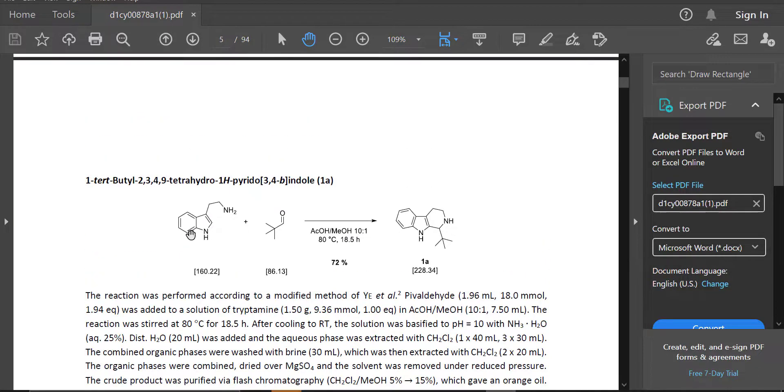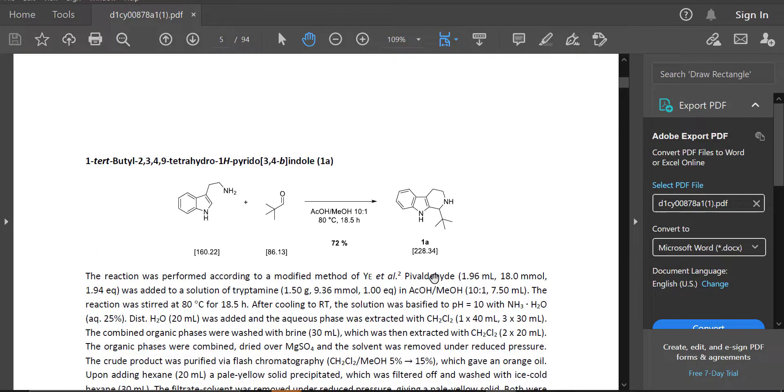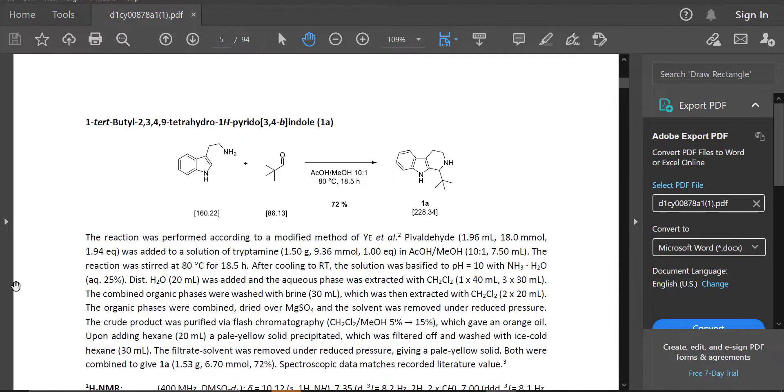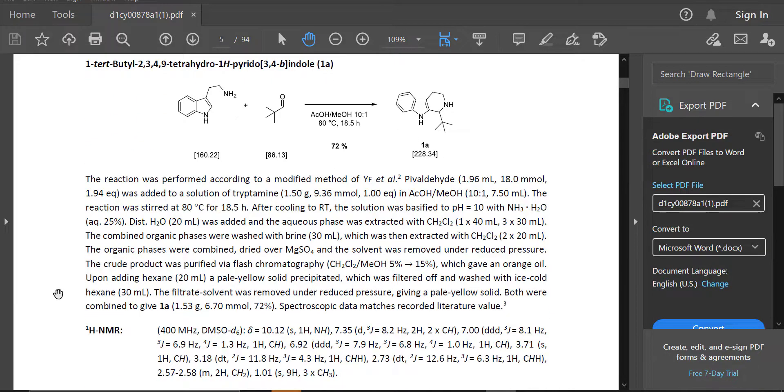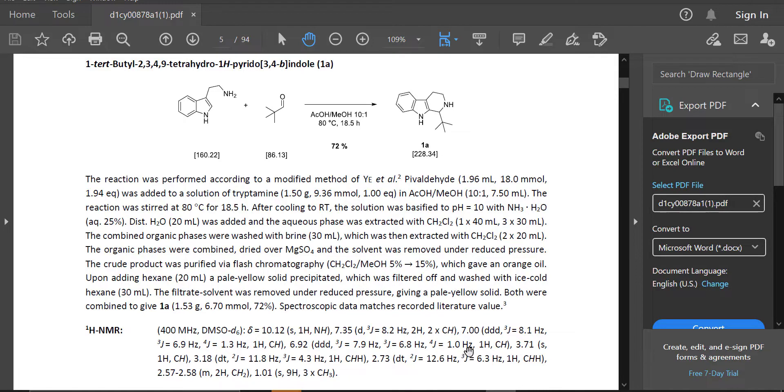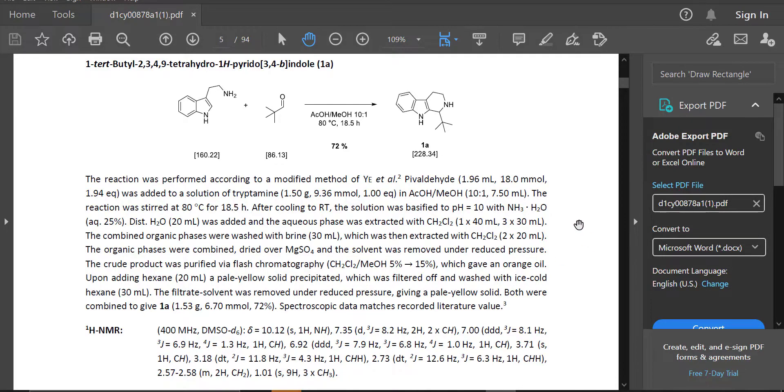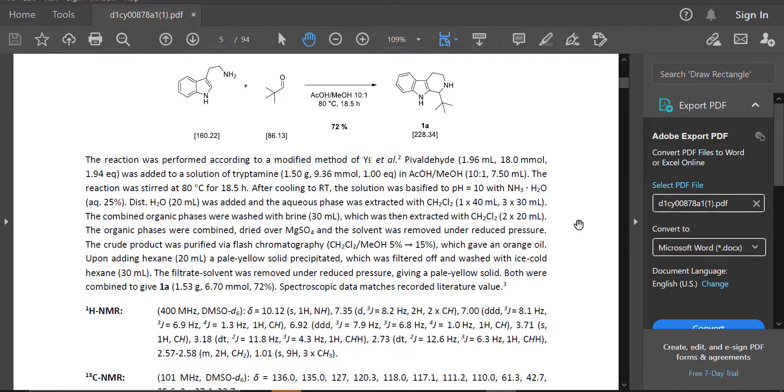Ah, here it is. So here is the first step of the reaction that we want to do. And we can take a look here at how exactly they synthesized it. So you can read this paragraph and then modify the procedure for yourself if you were to actually do this reaction.